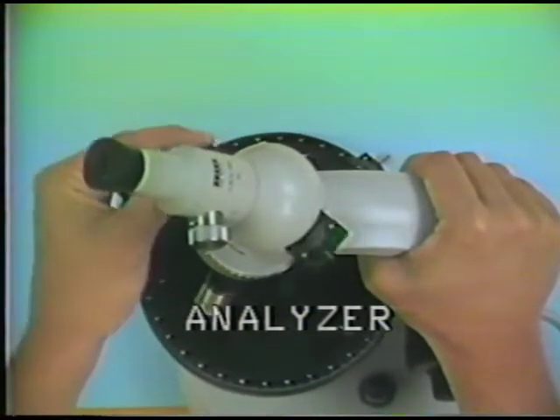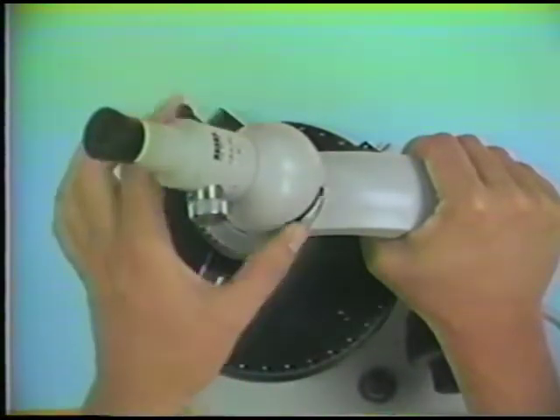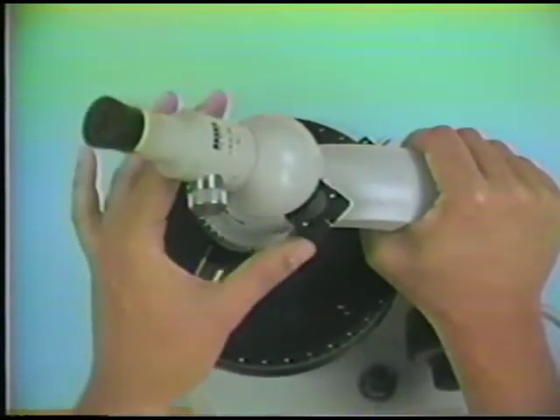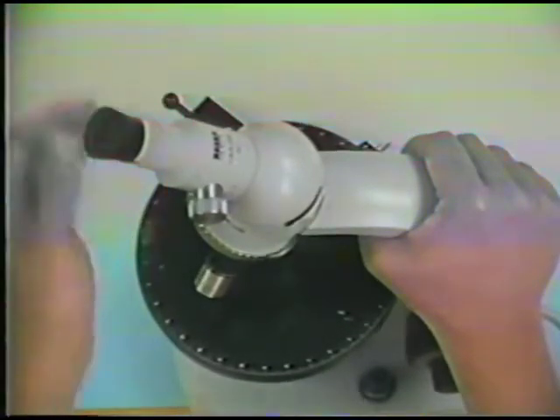So it flips in and out very readily. And that's symptomatic of the fact that you are all the time, when you're using the petrographic microscope, putting this analyzer in and out. So this upper polarizer is called the analyzer. It flips in and out, and you look at specimens both with it and without it very commonly.